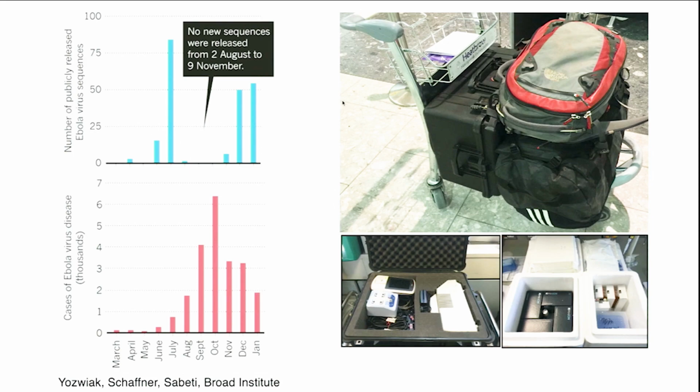And we found that a very small amount of equipment is required to do sequencing in a field-based situation, working with already made safe diagnostic samples. So this is all you really need to get a basic sequencing lab set up. And this is just my PhD student's pants and socks. You don't need that for DNA sequencing. It's useful to have a change of clothes.